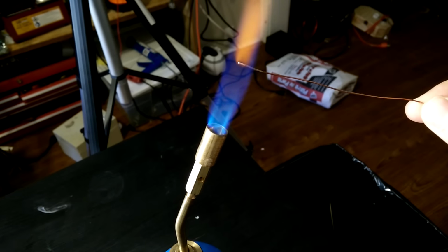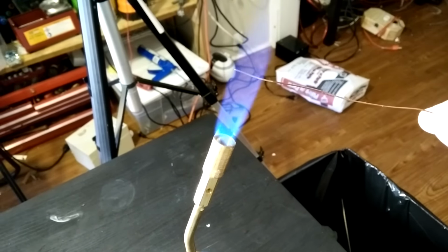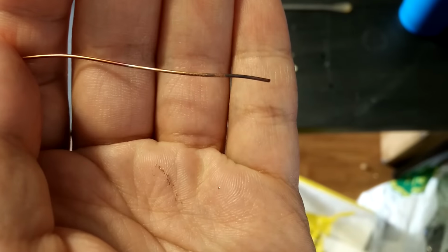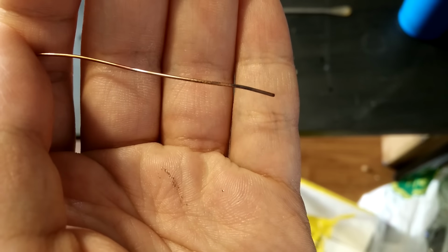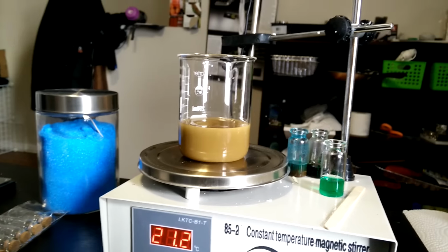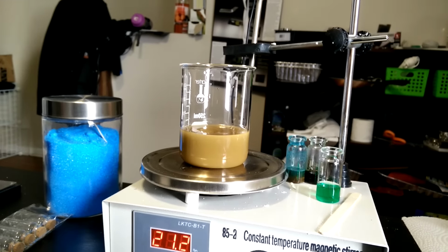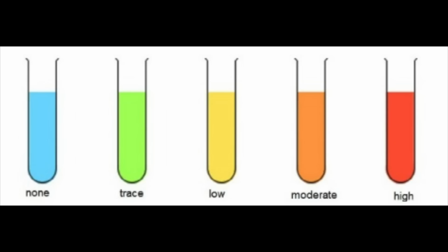There are many ways to make copper oxide. You could make it directly by reacting oxygen with copper, but this doesn't give you very good control over the shape or properties of the oxide, and you'll often overdo it, and the red copper-1 will be destroyed to leave only black copper-2. While I was looking for a way to synthesize copper-1 oxide, I found a simple experiment most people do in high school.